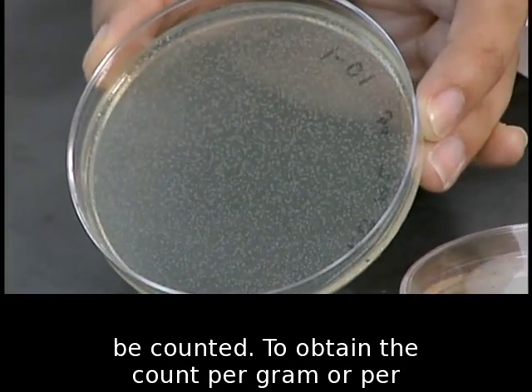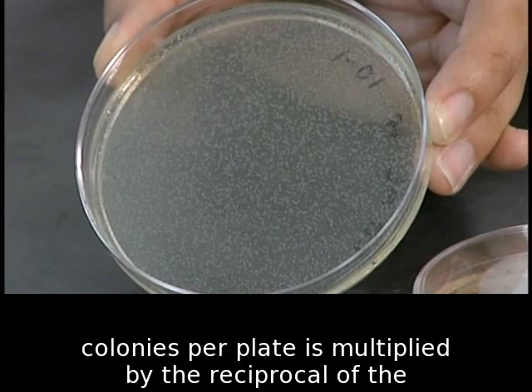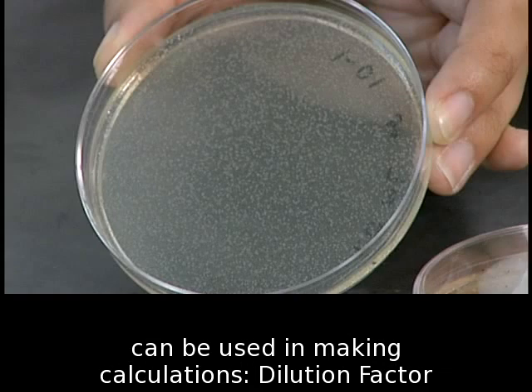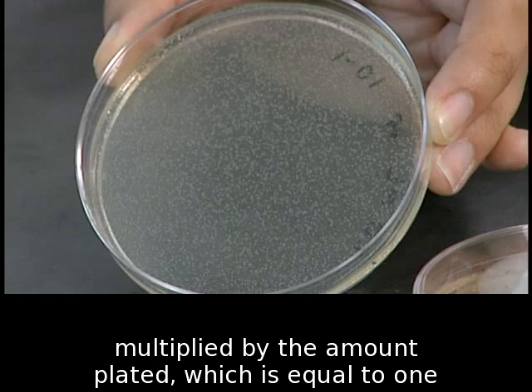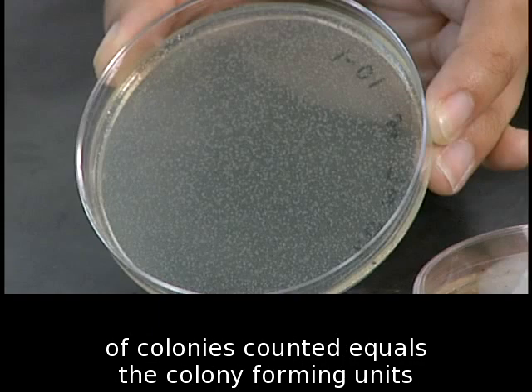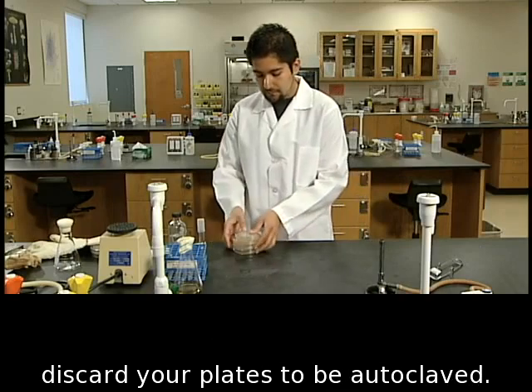To obtain the count per gram or per milliliter of the original sample, the average number of colonies per plate is multiplied by the reciprocal of the dilution factor for those plates. The following formulas can be used in making calculations. Dilution factor equals initial dilution multiplied by subsequent dilutions multiplied by the amount plated. The colony-forming units per gram equals 1 divided by the dilution factor multiplied by the number of colonies counted. After recording all of your data, properly discard your plates to be autoclaved.